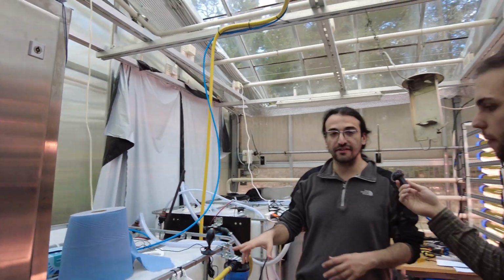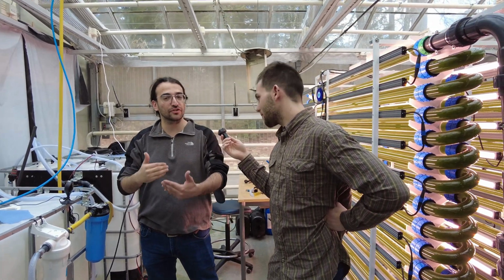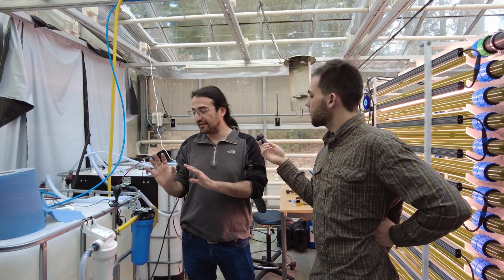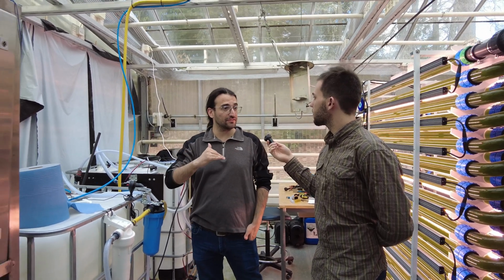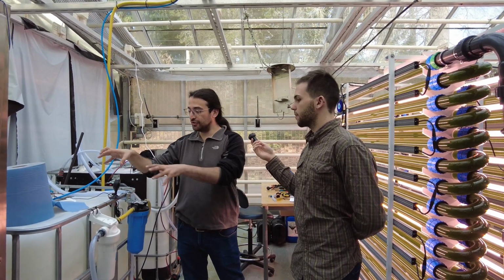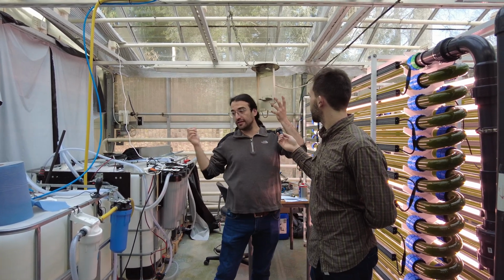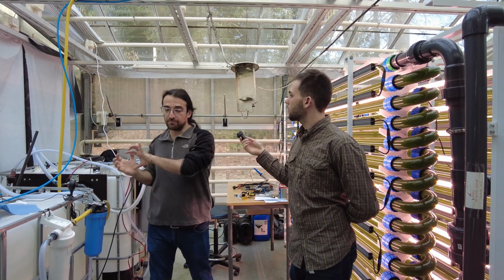So this is the recycled or recirculated wastewater, and we are taking a sample from it and checking what their current nitrogen level, phosphorus level and pH are. And then there is a thing: if we are seeing that nitrogen and phosphorus levels are not below the regulatory level, we cannot discharge the water. So we need to pump this recirculated water back to the PBR again, combining the fresh wastewater and the recirculated wastewater, and pumping the system again.